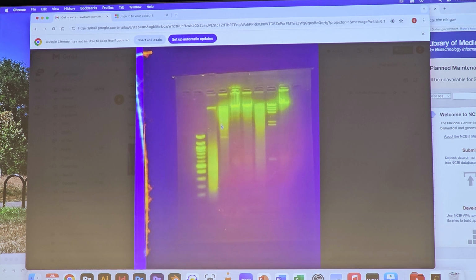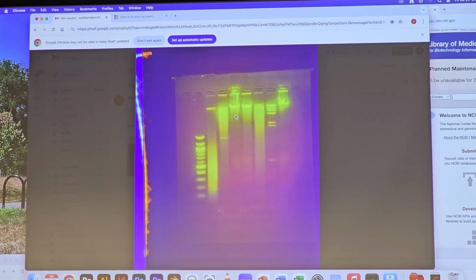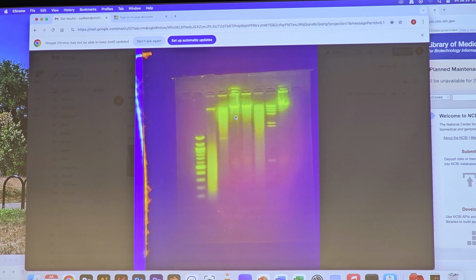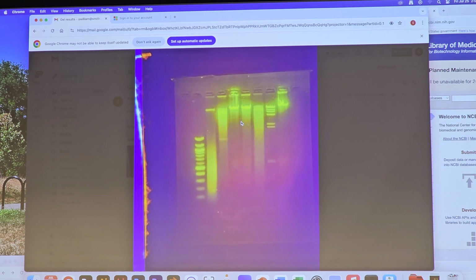Okay, so that's the EcoR1 digest. Then the next digest is the SfiI digest. SfiI is an 8-cutter, and so it cuts 1/4 to the 8th power, which is once every 64,000 base pairs. So you'd expect your SfiI digest to look a lot like uncut DNA, which is over here, and it does. You see maybe a little bit of digestion from regions of the genome where just by chance you have 2 SfiI sites fairly close together.